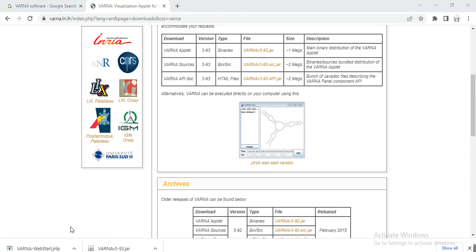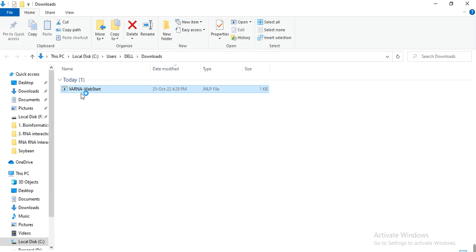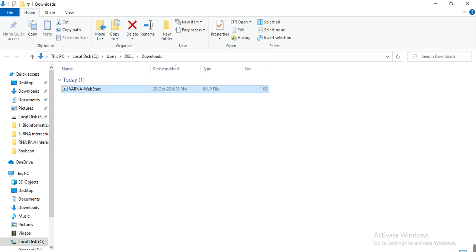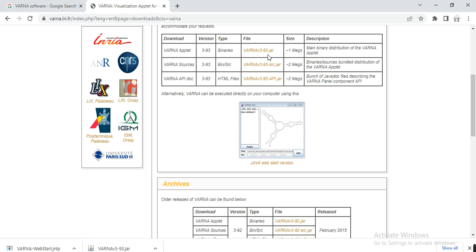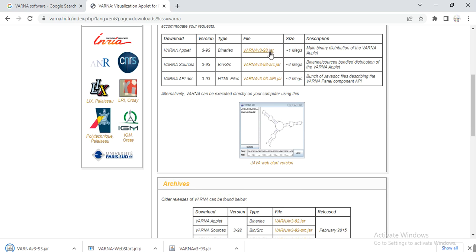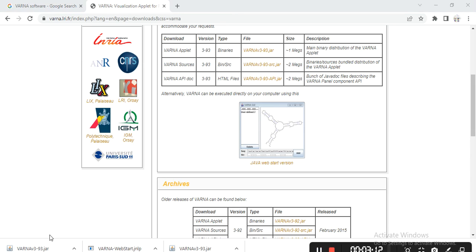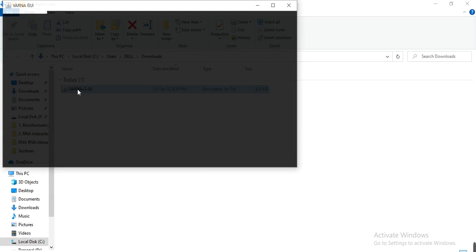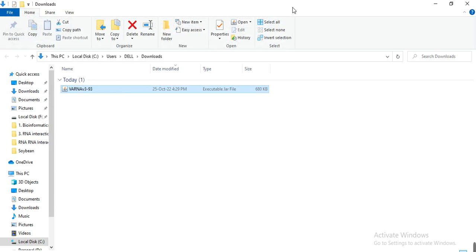Open it and start. Right-click to start the software, but here it shows that it fails to validate the certificate and the application will not be executed. You can try the version VARNA v3-93, then open the folder and right-click to start. It has started, but sometimes it gives an error.